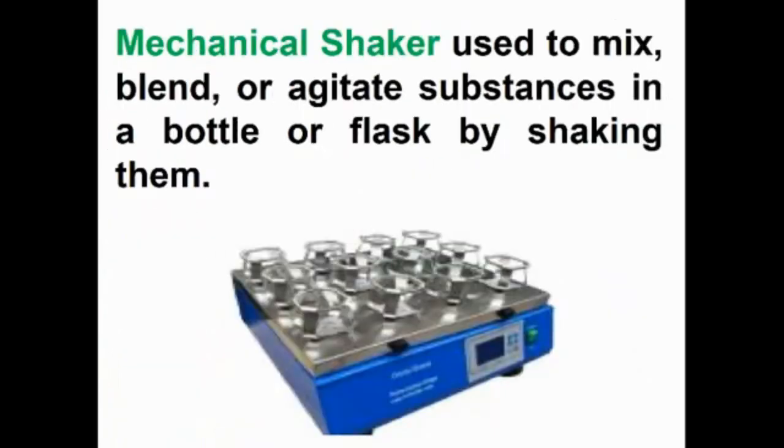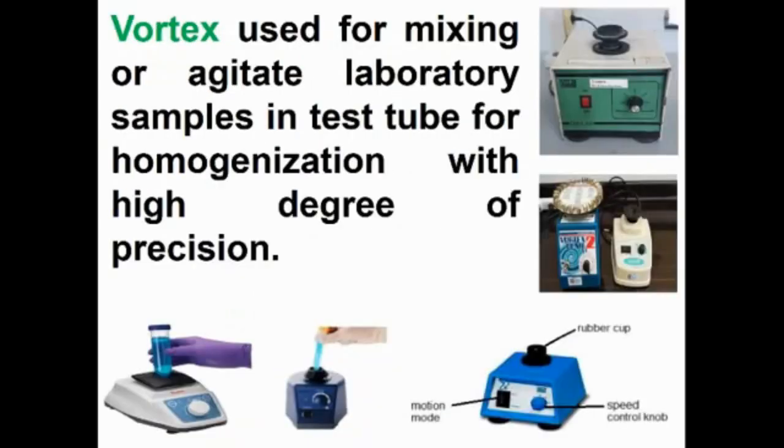Mechanical shaker, used to mix, blend, or agitate substances in a bottle or flask by shaking them. Vortex, used for mixing or agitating laboratory samples in test tubes for homogenization with a high degree of precision.